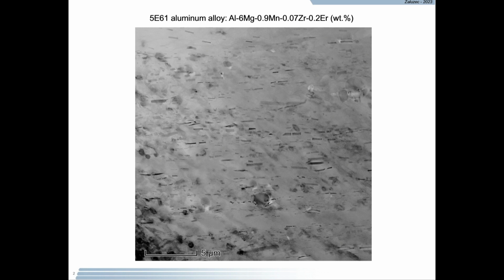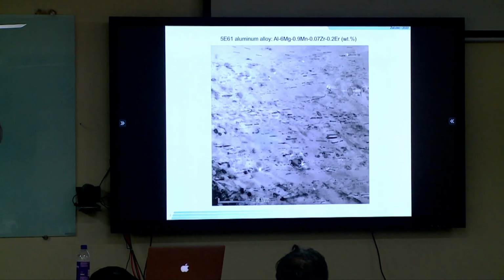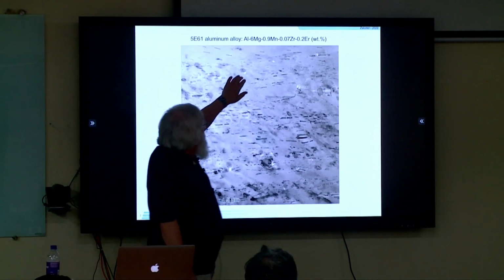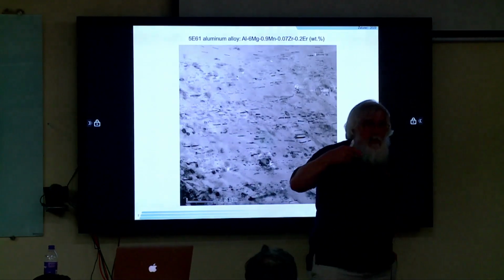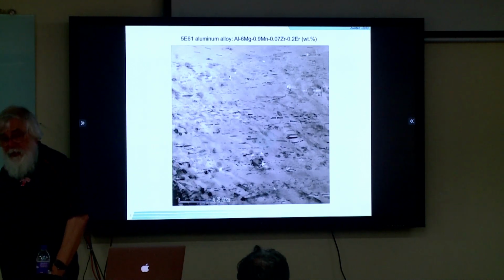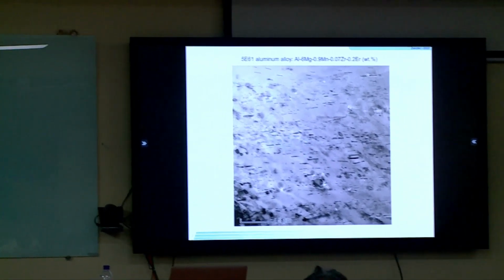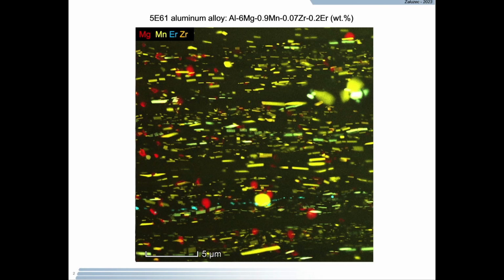What if I could go up to this, and this is an engine aircraft alloy, an aluminum alloy. What if I can go up to that, and the question is, we've added alloying elements, can the diffraction contrast experiments tell us where those alloying elements are? Not very easily. However, if we use inelastic scattering spectroscopy on that same area, that image becomes that image.